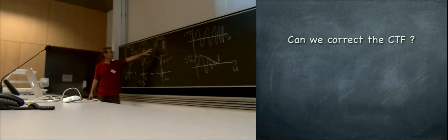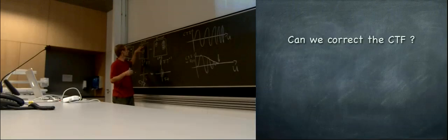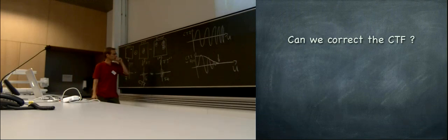And now this will be a deconvolution step. There are computer algorithms that can do that. So they go here and we try to find what the point spread function is, and you try to search, and if you can find your point spread function, and if yes, then you have an atom, and if not, then maybe not, but it's really complicated. And it's much easier, much faster for the computer to use this way.